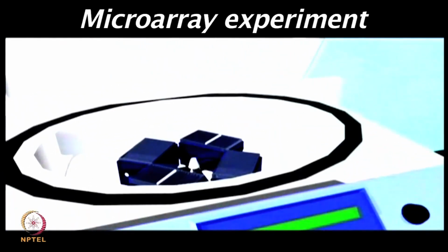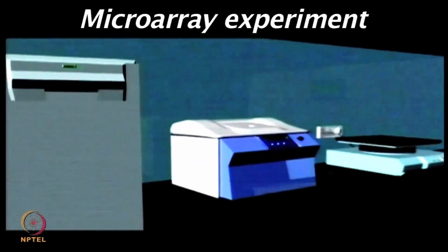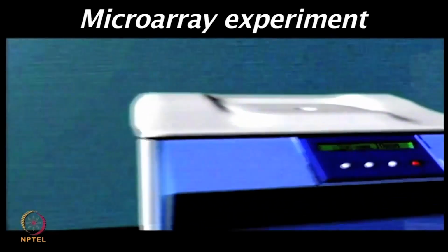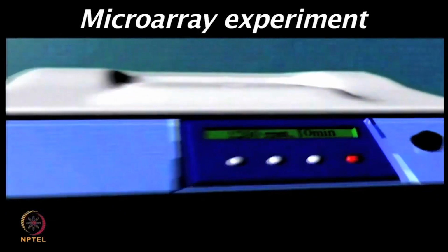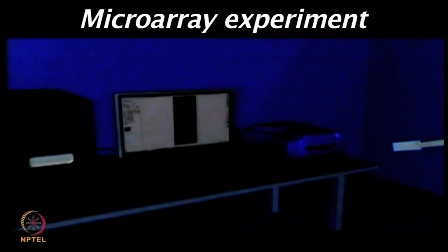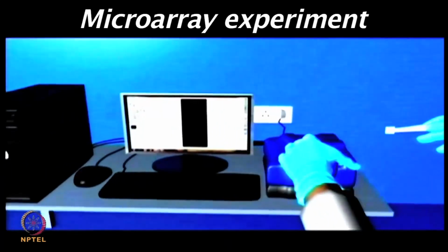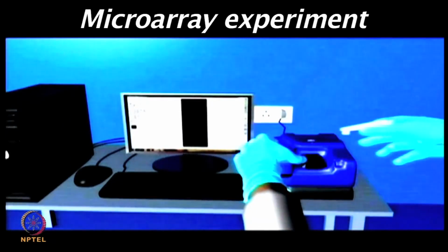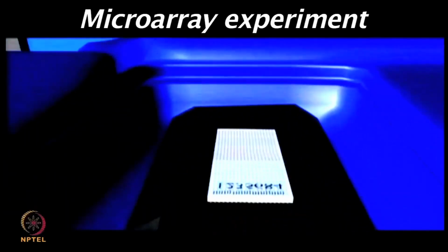Now, you have to ensure the right type of rotations while you are centrifuging the chips. Once the drying process is completed, the chips can be scanned by using scanners and selecting the appropriate wavelength.